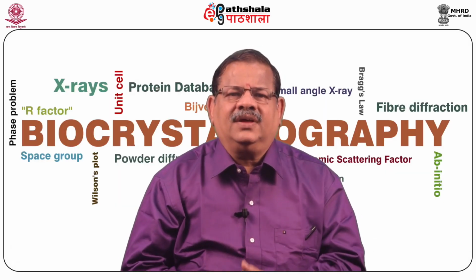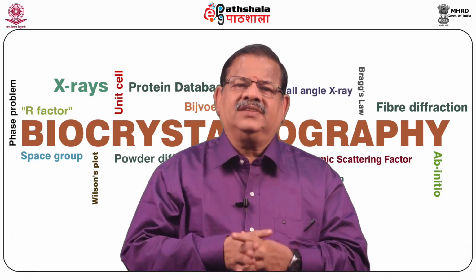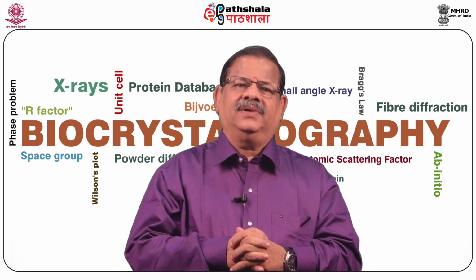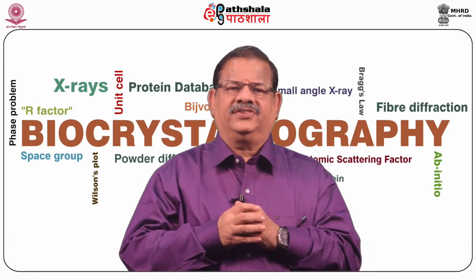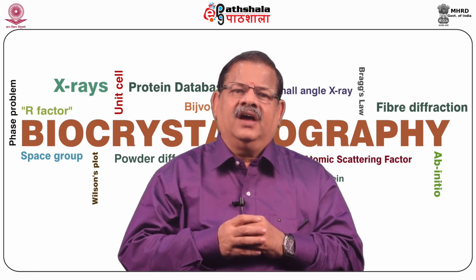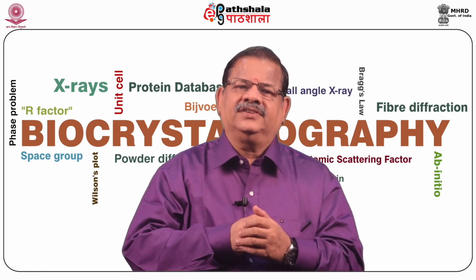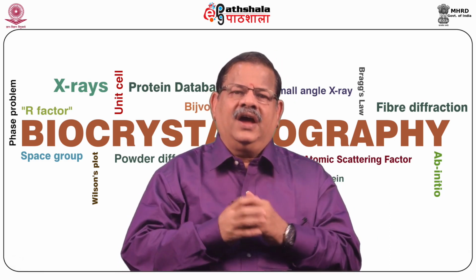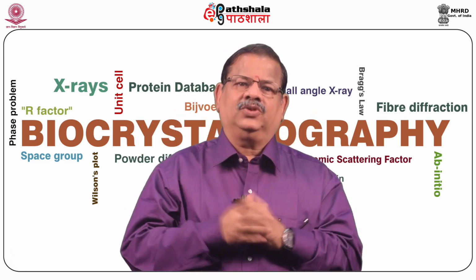Let us now learn something about the SHELX suite of programs. The multiwavelength anomalous diffraction, MAD, method has greatly benefited from the recent advances in synchrotron technology, cryocrystallography, and the incorporation of selenomethionine into proteins, and has become a useful and effective approach to the structure determination of macromolecules.